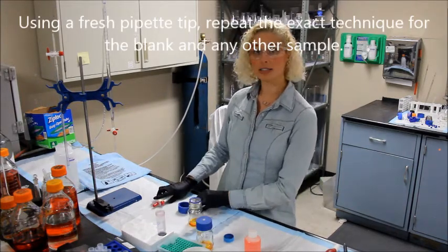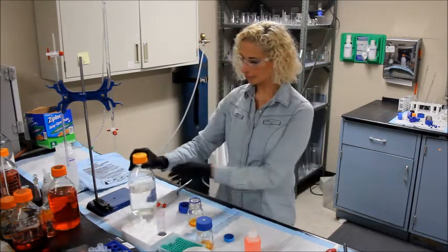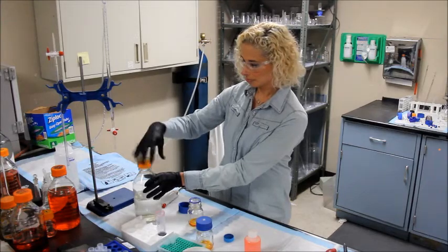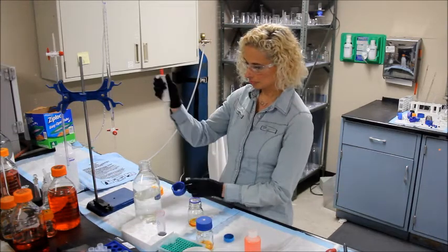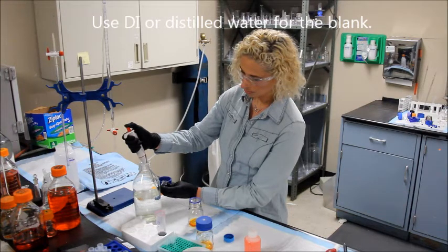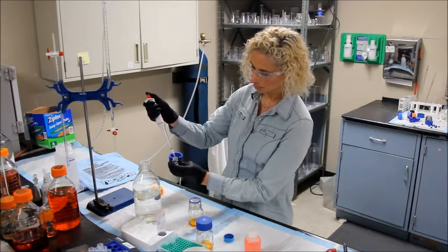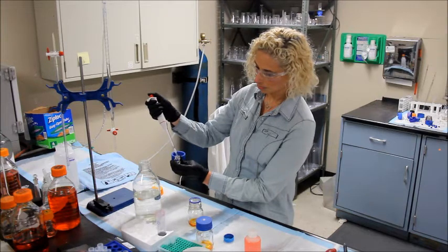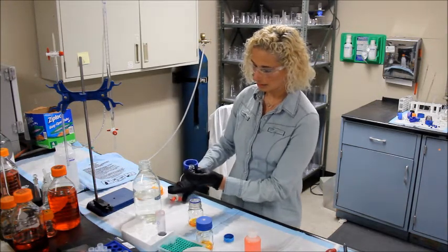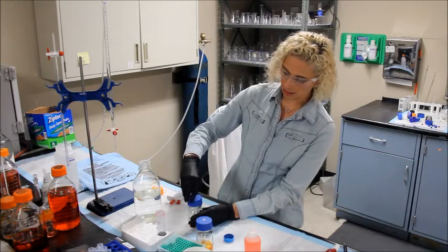And for your blank, you'll use ultra-pure distilled or deionized water. Immediately place the sample bucket into the second reaction bottle.